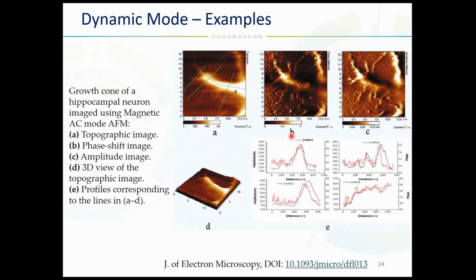And Alzheimer's disease, for those who are not very familiar with it, is a neurodegenerative disease, the most common case of dementia of older people, and usually it appears when a certain protein is aggregated in the brain, usually amyloid beta peptides and phospho-tau as well. So why the researchers decided to check these neurons using AFM is because the advantage of AFM is that we can check this neuron under physiological conditions.